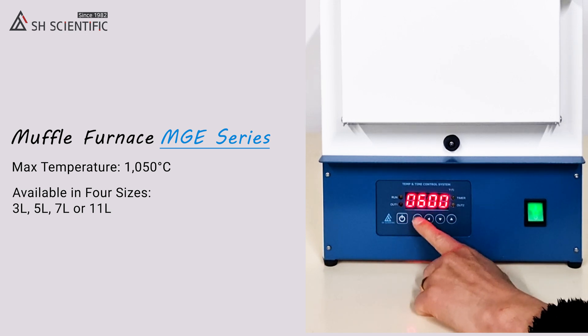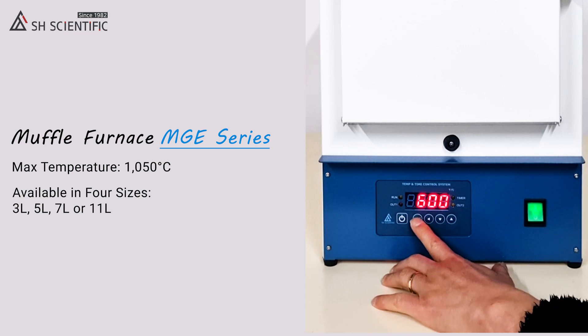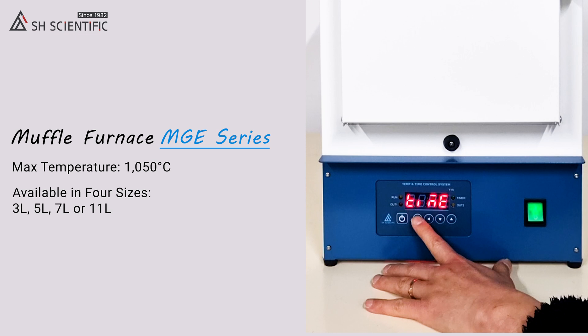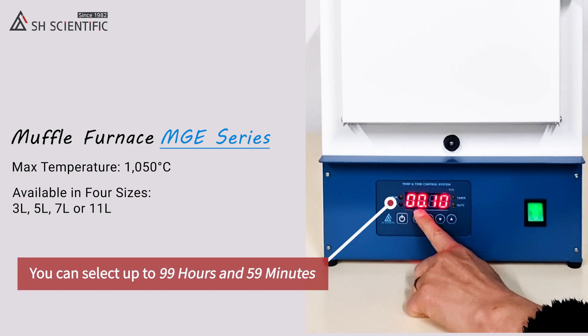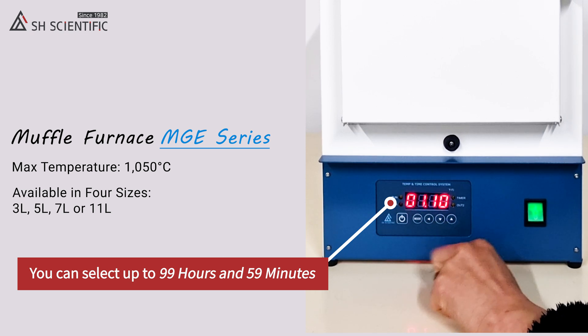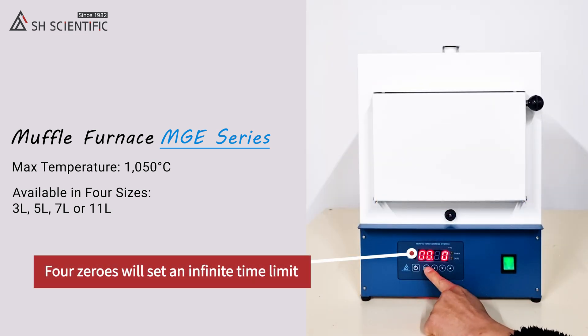Press the Mode button once more to save your temperature and move on to time settings. Time settings tell the furnace how long to maintain the temperature we just selected — they do not include heating or cooling time. You can select up to 99 hours and 59 minutes in one-minute intervals. Four zeros will set an infinite time limit, so be careful not to use that setting by accident.